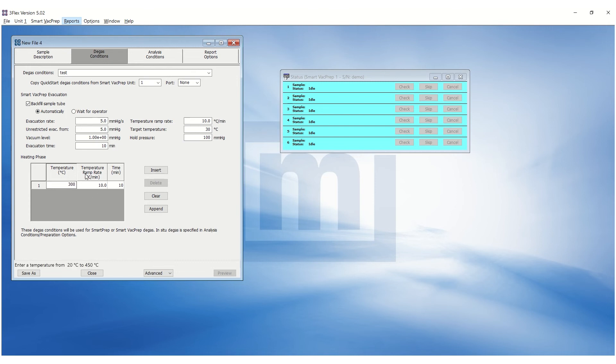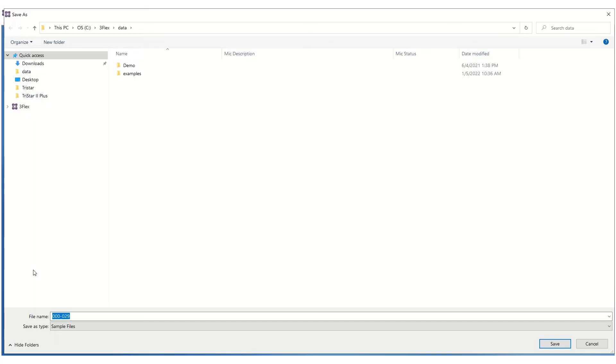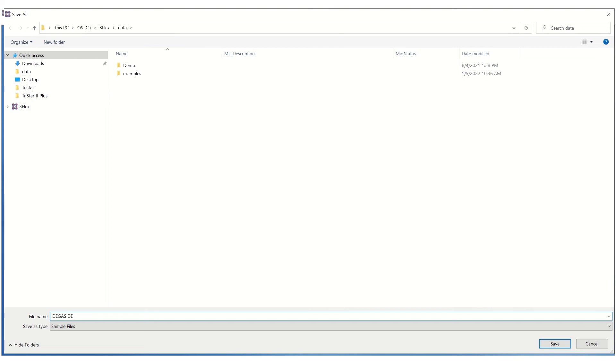Under the heating phase, enter the desired temperature, ramp rate, and time. Save the file. Note the same SMP file can be used for degas and analysis.